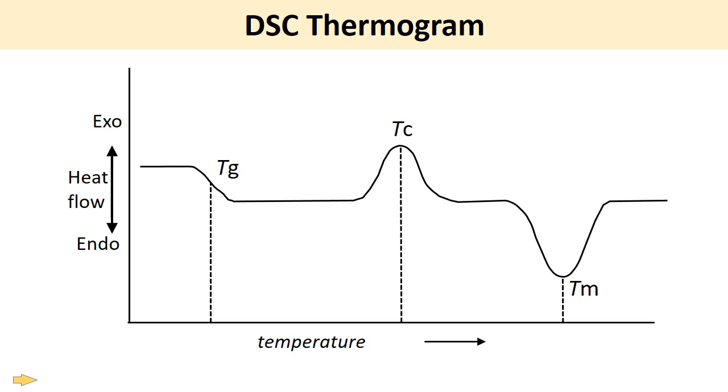For a sample undergoing a change in heat capacity, we talk about the glass transition, which is a rather subtle kind of phase change. Here we are not talking about a formal phase change, we are talking about a change in heat capacity. It occurs as the temperature of an amorphous solid is increased. When this temperature is increased, a stage is reached where the amorphous solid becomes less viscous. At some point, if still heated, the molecules may obtain enough freedom of motion to spontaneously arrange themselves into a crystalline form, which is this Tc we are seeing in the plot.